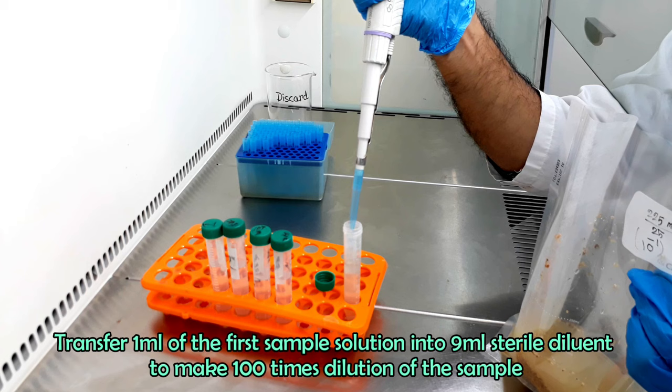Again, transfer 1 ml of the fifth dilution into another 9 ml sterile diluent to make 10 lakh times dilution of the sample. This dilution is called 10 inverse 6. Vortex the sixth dilution. Dilute your sample more if you expect a greater number of bacteria in your sample.